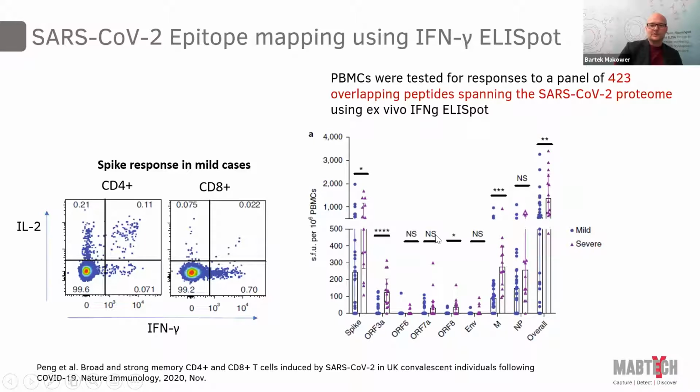And in flow cytometry then, as you see, I often show both ELISpot, fluorospot, and flow cytometry data. That's because they're very often used in combination. So they are really complementary, very good orthogonal methods showing the same thing sometimes, which is a real strength. So if you show the same thing using orthogonal methods, that gives really more power to your data and conclusions.